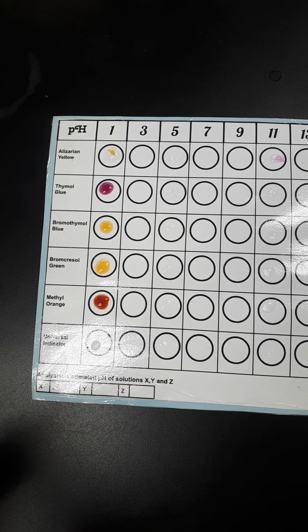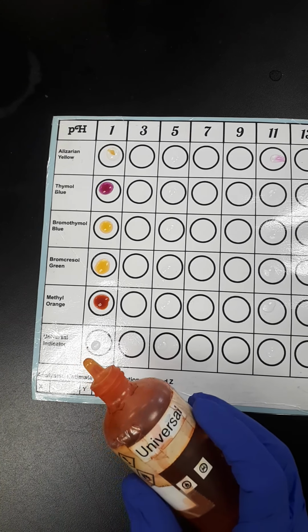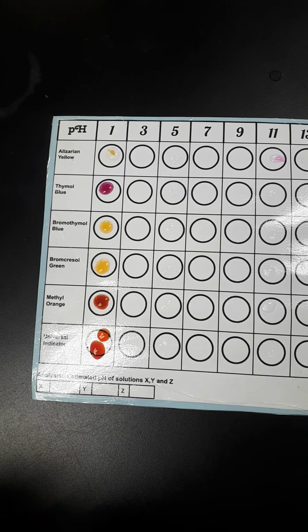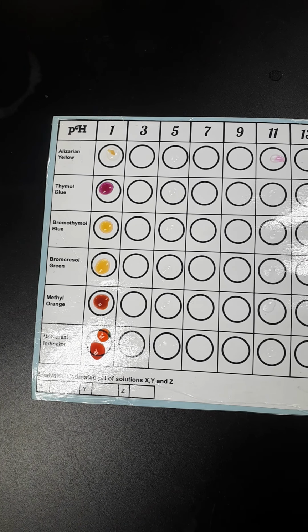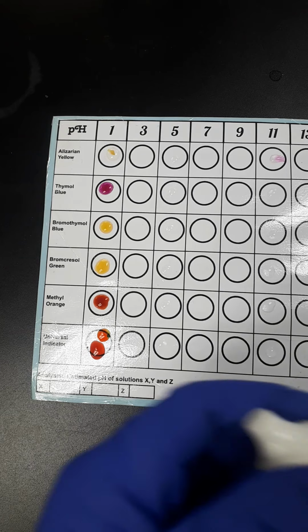Universal indicator is kind of a neat thing. Universal indicator is going to tell us, and I don't think I have the little piece with me here, but the universal indicator will change to a whole bunch of different colors depending on the pH, and we'll see that as we go through. So it's got a whole bunch of different ones. Okay, let's check out things with a pH of 5.